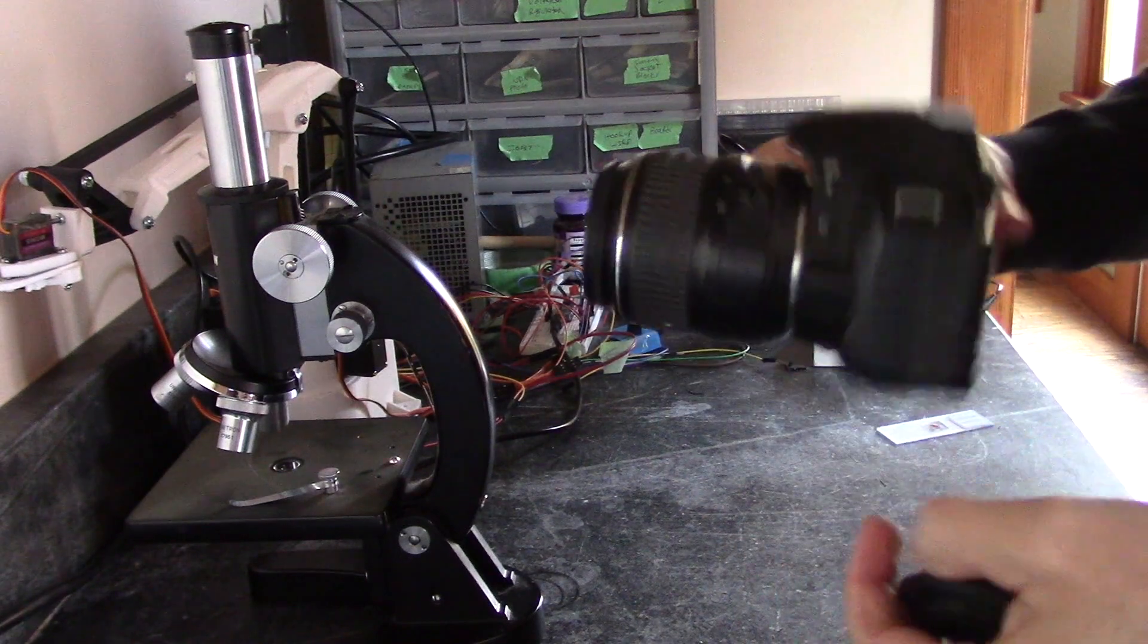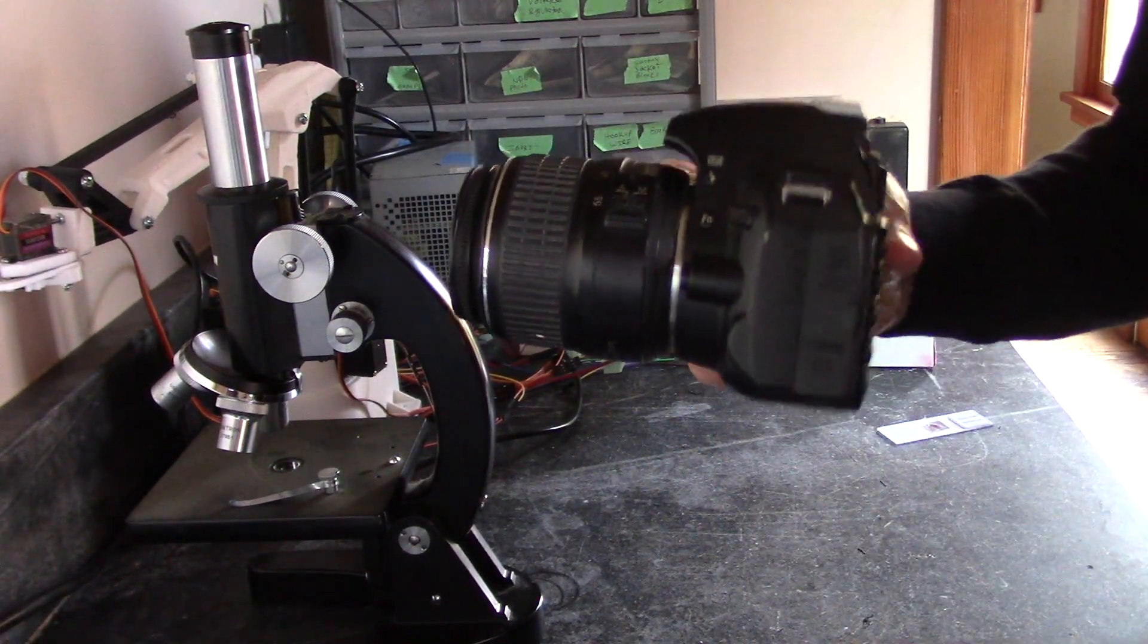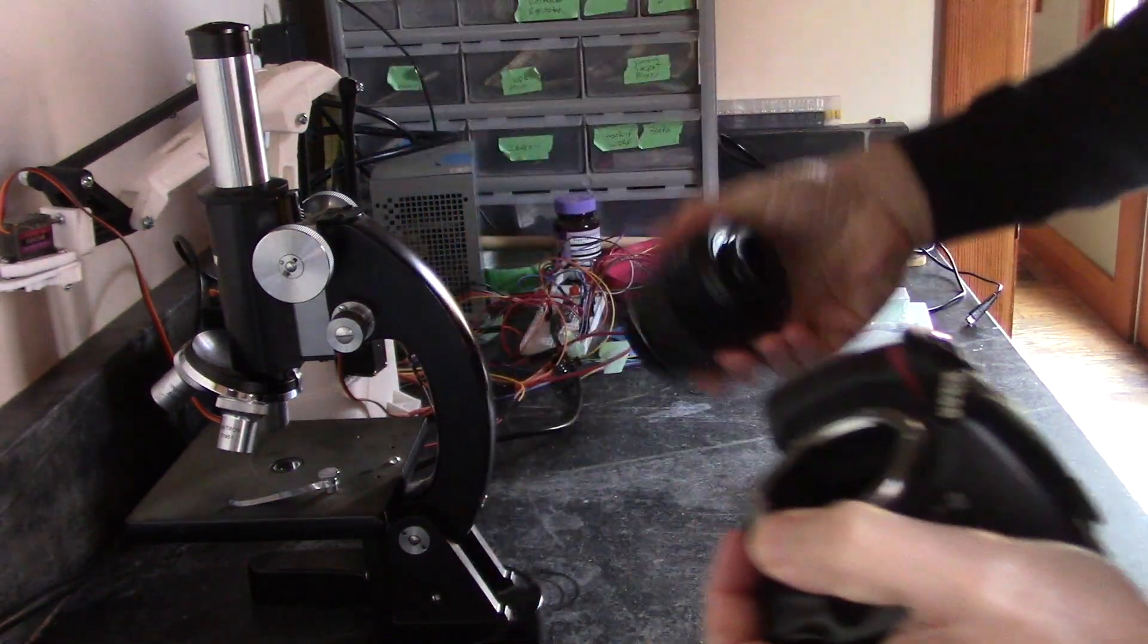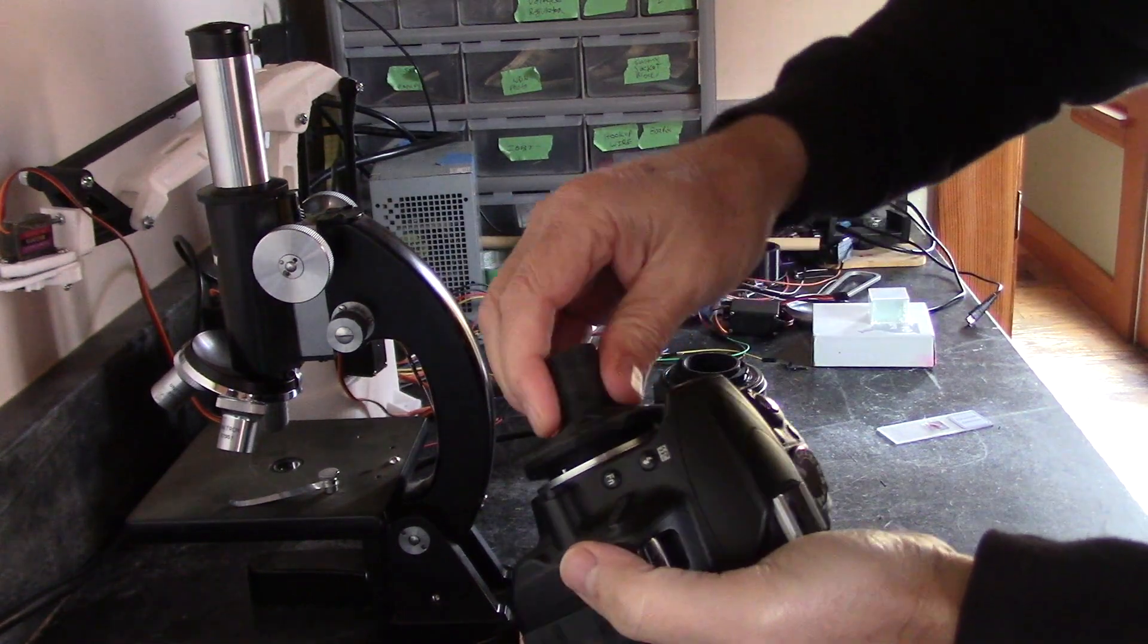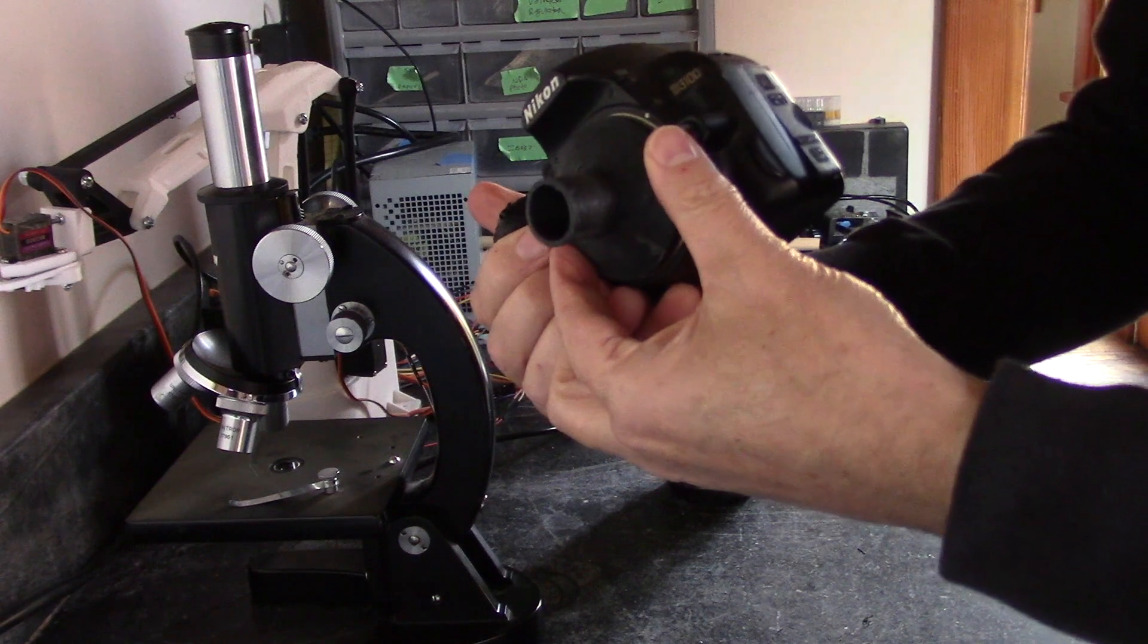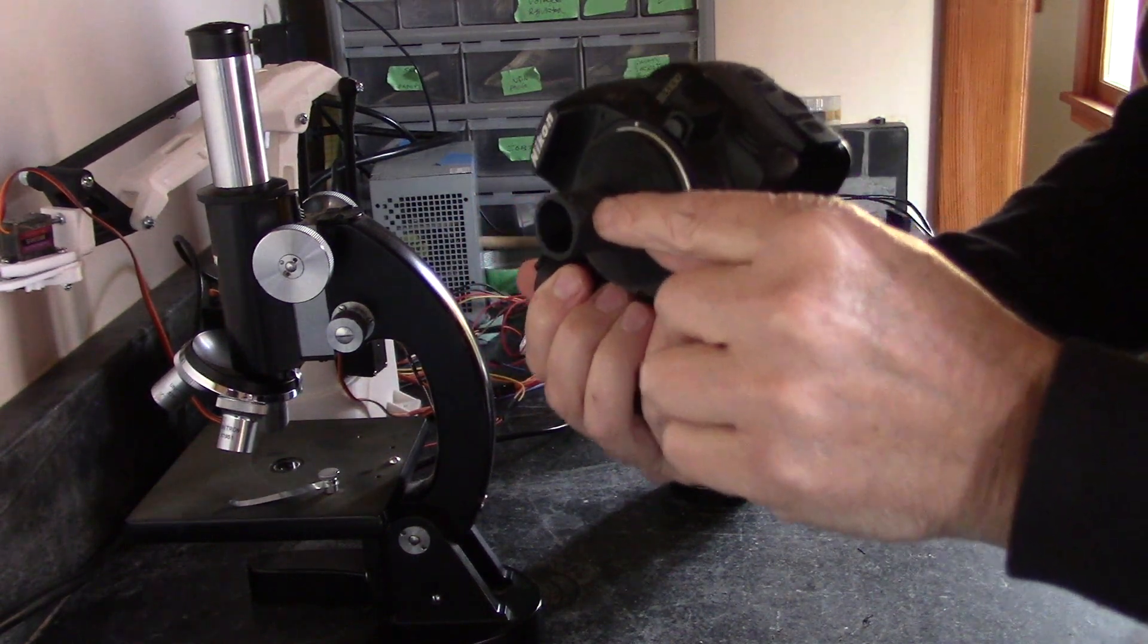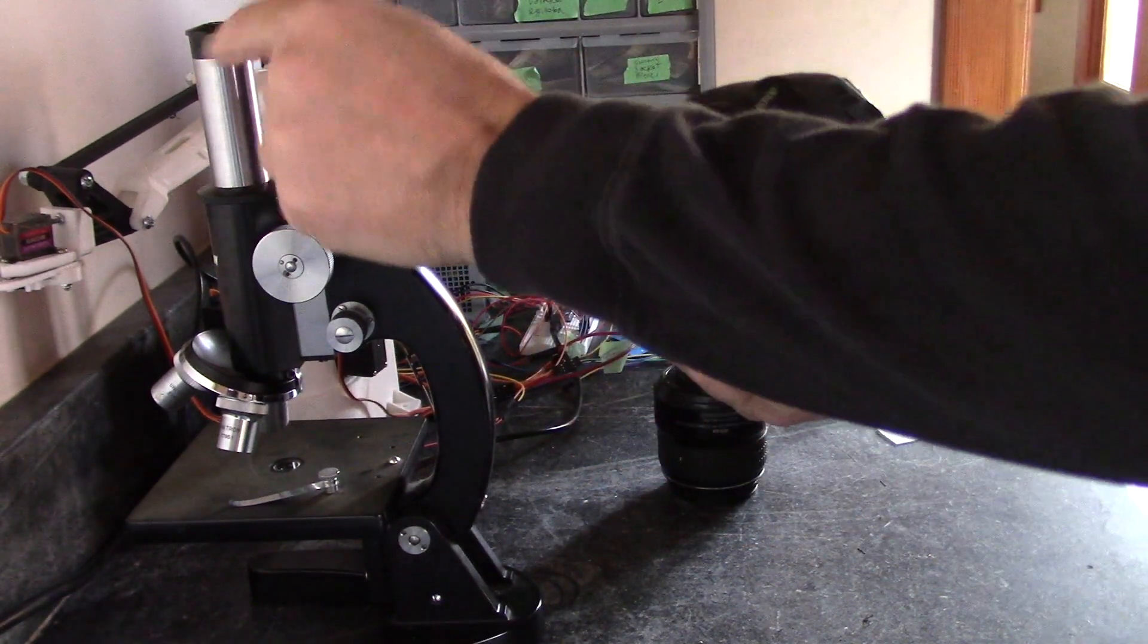And so this works by actually removing the lens on your camera. Let's see if I can find it, okay. And then it just snaps right in, alright. And then this is designed to go inside a 23mm eyepiece, which is what I have right here.